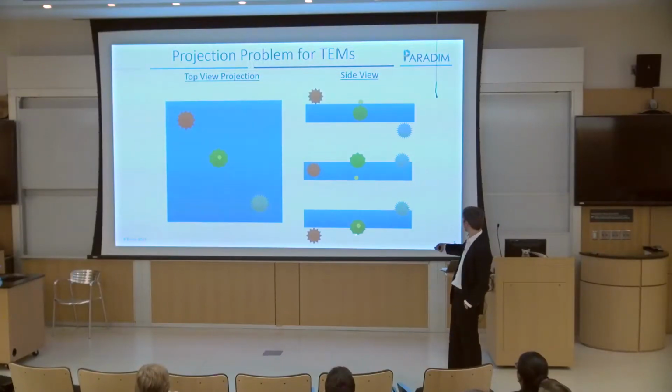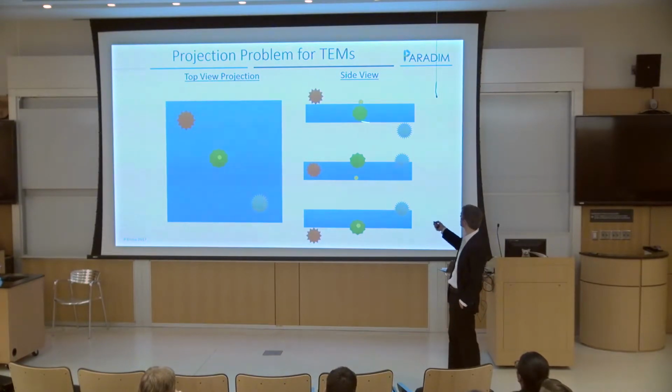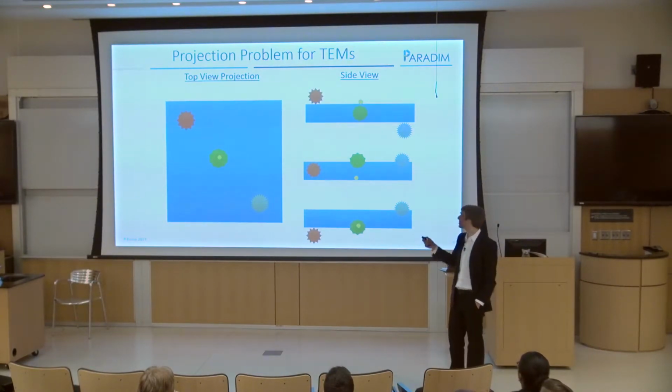So it's very important, like whether this nanoparticle or something is inside the cell, that makes a big difference as to whether it's inside or outside the cell, right? So what we're going to try to do is get a reconstruction where we can tell the difference between an object on the top, on the bottom, in the middle. And from a projection, since we see through the whole object, we're not just seeing the surface, we can do this. We can actually take our object apart after we reconstruct it. You can see inside the object.